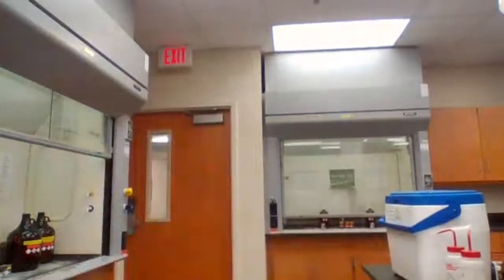When you have your lab manual, which you purchased from the Vital Source, the experiment part A is saying to use a test tube. So I'm just going to get my test tubes here.